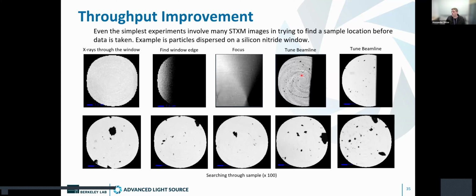What this does for them is they can then use this to figure out where they're getting these dips in intensity, because the AFM has this same issue essentially. And so they have an algorithm for this that we're exploring how to use, because that could be quite nice, as it could essentially eliminate this noise. Okay, thank you.